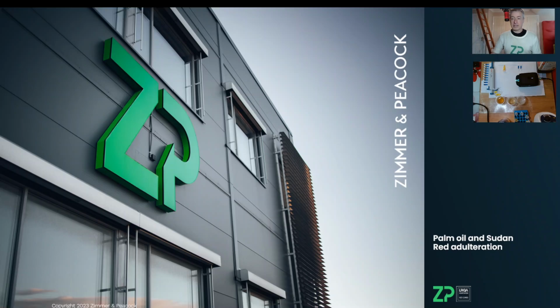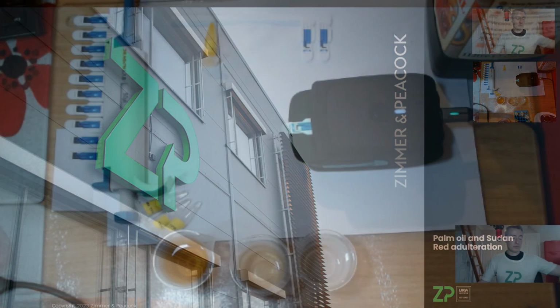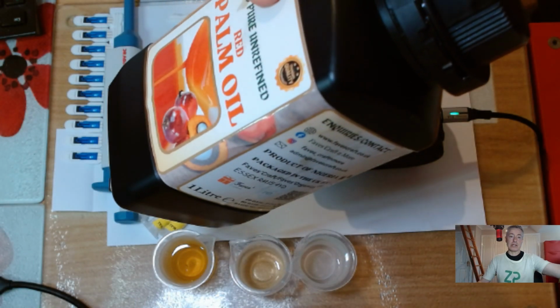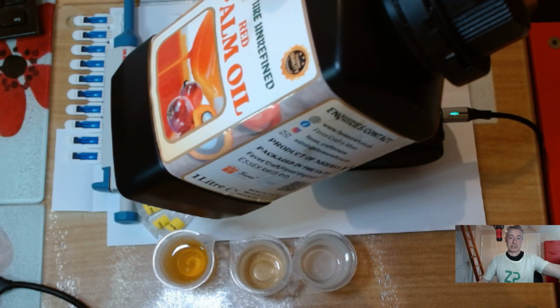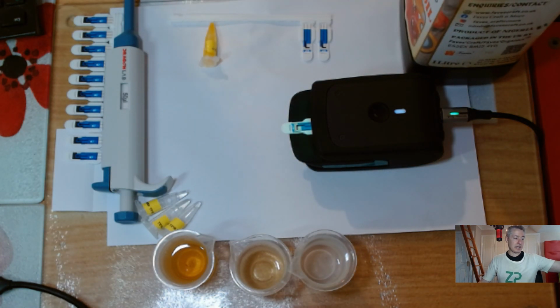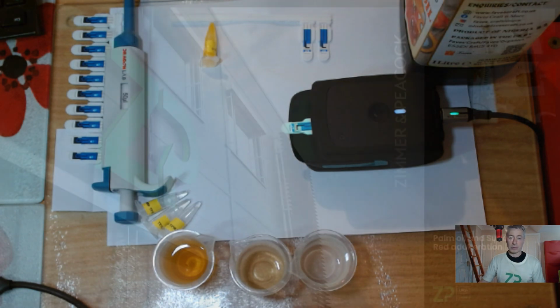Hi, good morning. In this video, I'm going to do the analysis of palm oil. We've had an inquiry. It's quite a serious problem that they're trying to solve. I'll discuss that problem very quickly and also discuss how the technology stack can help them. So don't think that this is going to be all talk. In fact, I'll go back to the slides now.